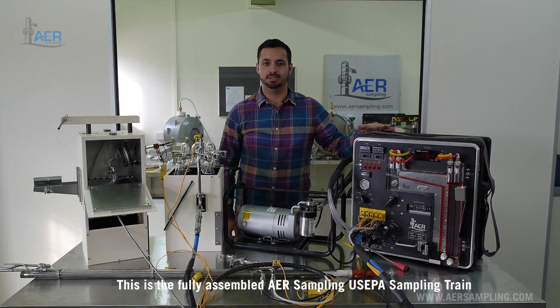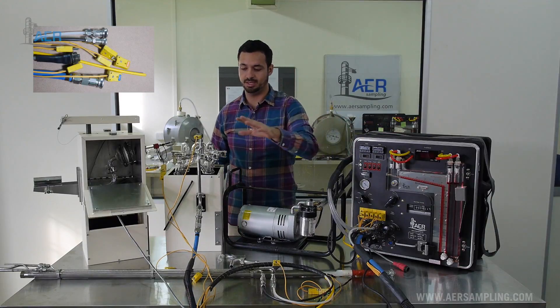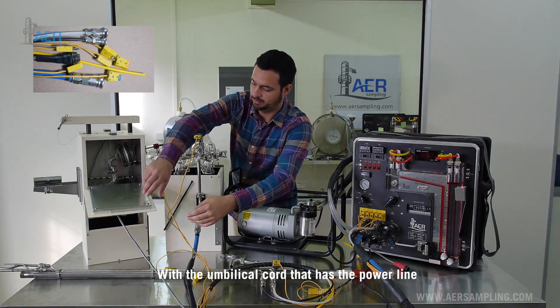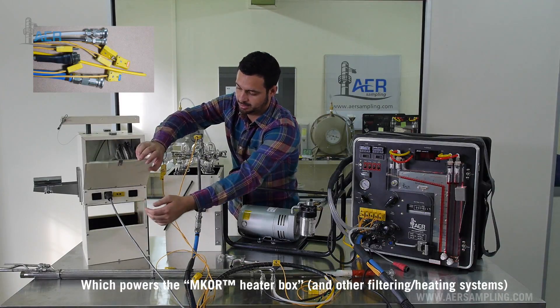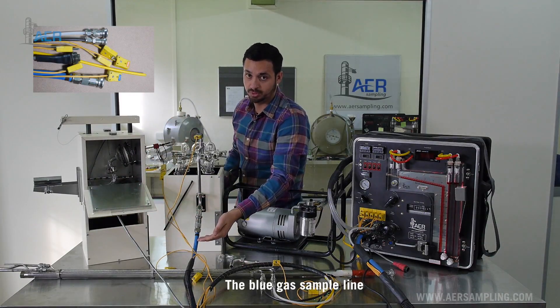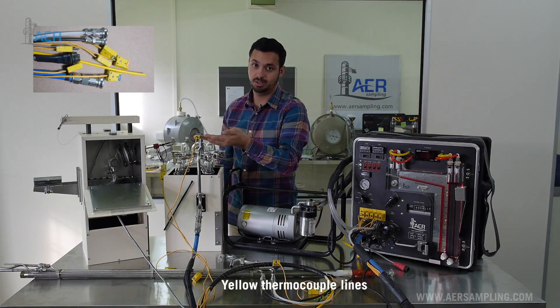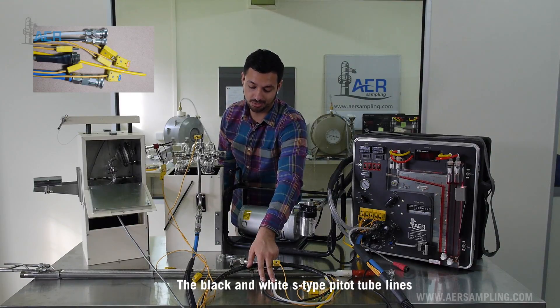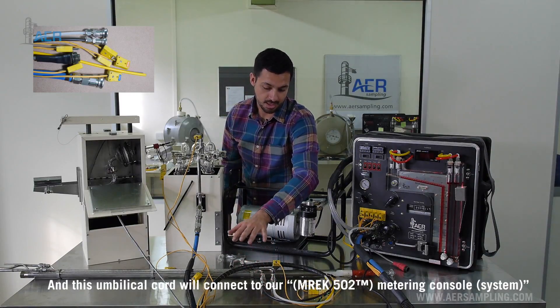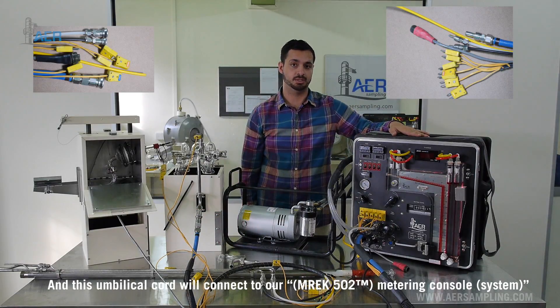This is the fully assembled AER sampling US EPA sampling train with the umbilical cord that has a power line which powers the heating box, the blue gas sample line, yellow thermocouple lines, and the black and white S-type pitot tube lines. This umbilical cord will connect to our metering console.